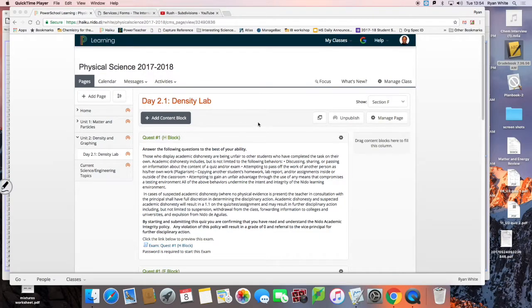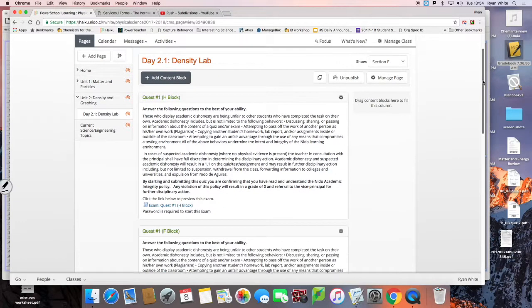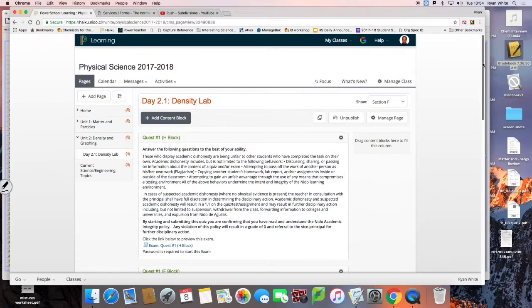Hi Science Gurus, this is Dr. White. I'm sorry I couldn't be here today but I want to take you through how to look at your data using Logger Pro.